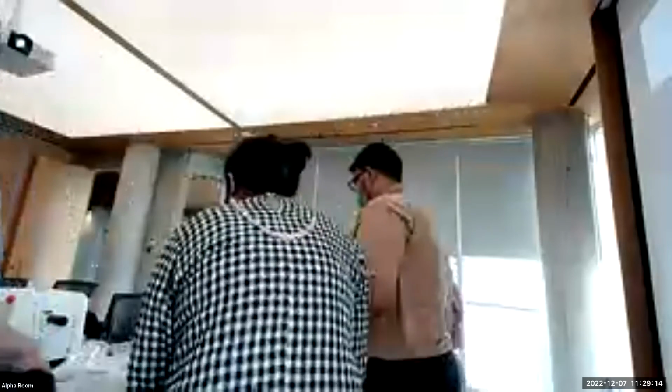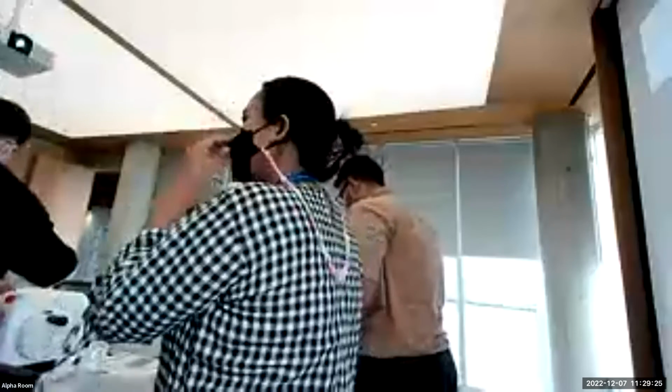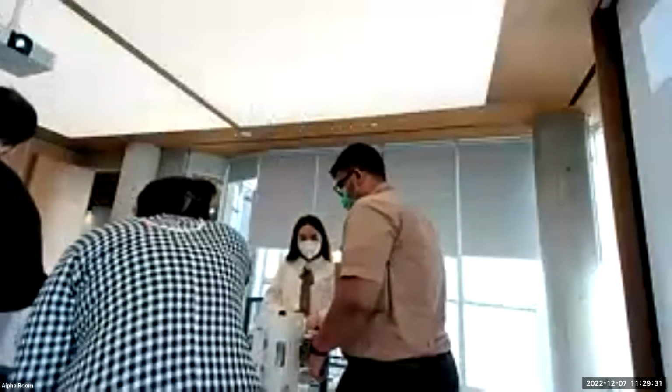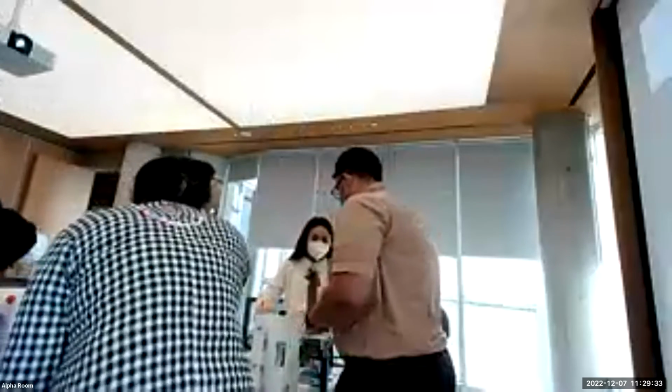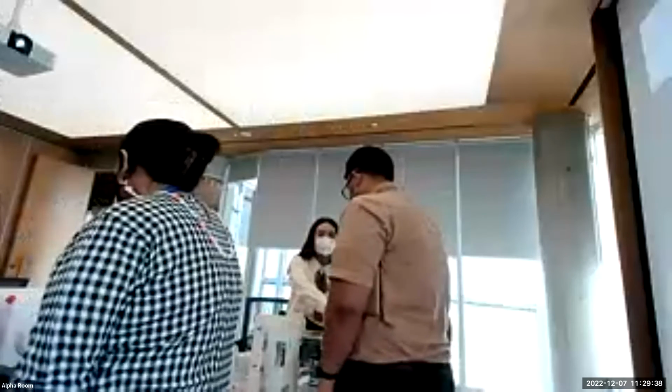So for example, after we do the anesthesia in an animal, how do we clean this equipment? Do we need to clean it like this also? No, just clean this chamber. This one we don't need to clean, because the carbon dioxide is here, so there's nothing.